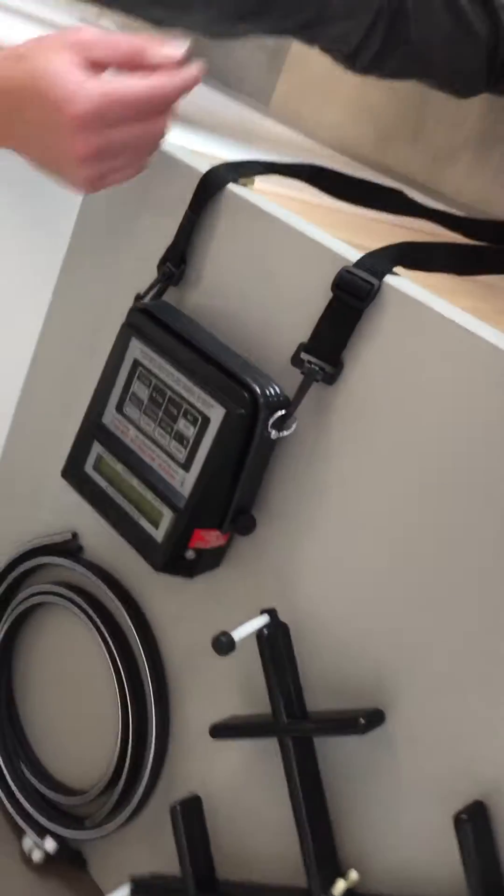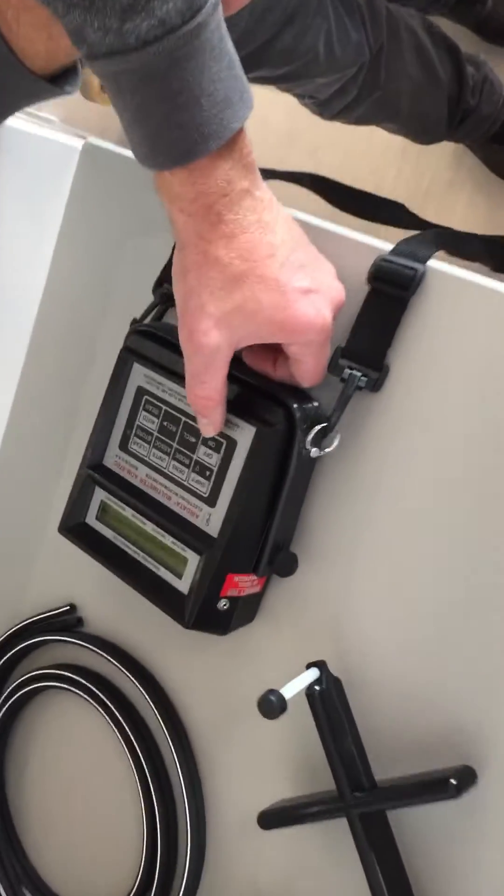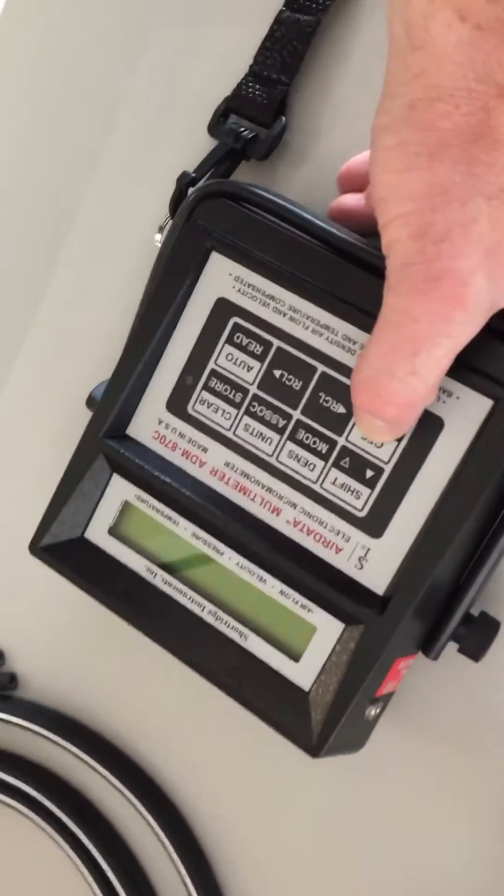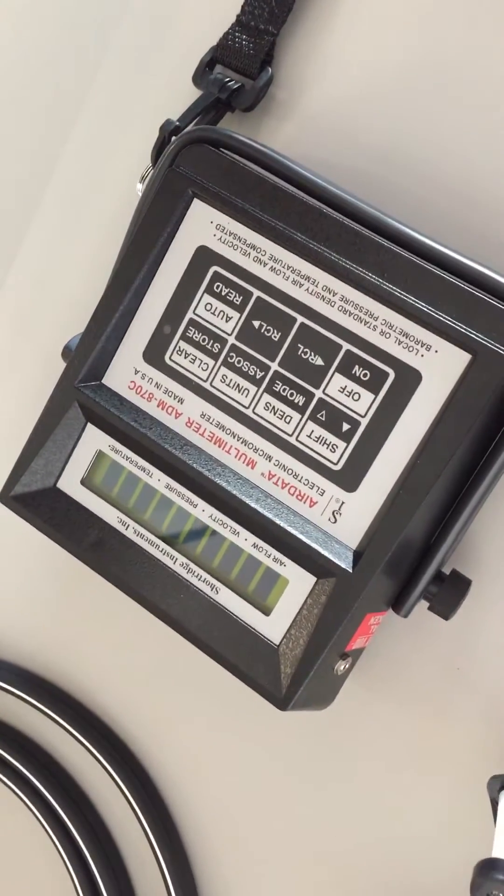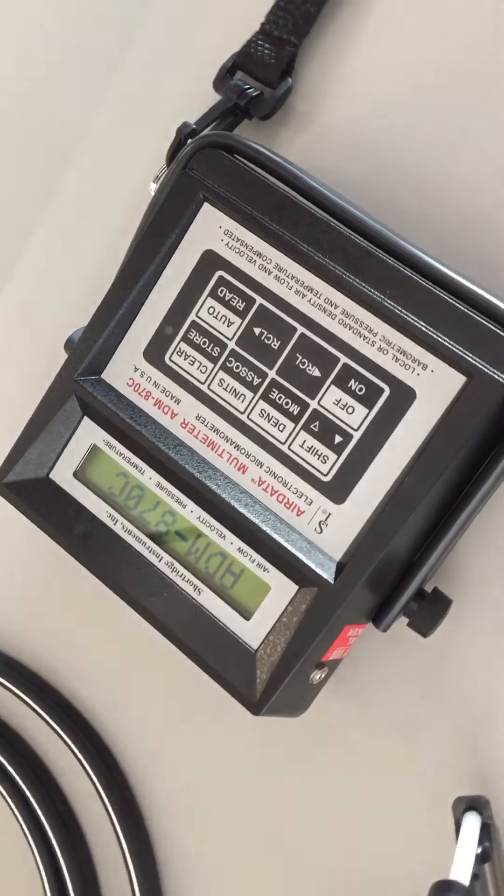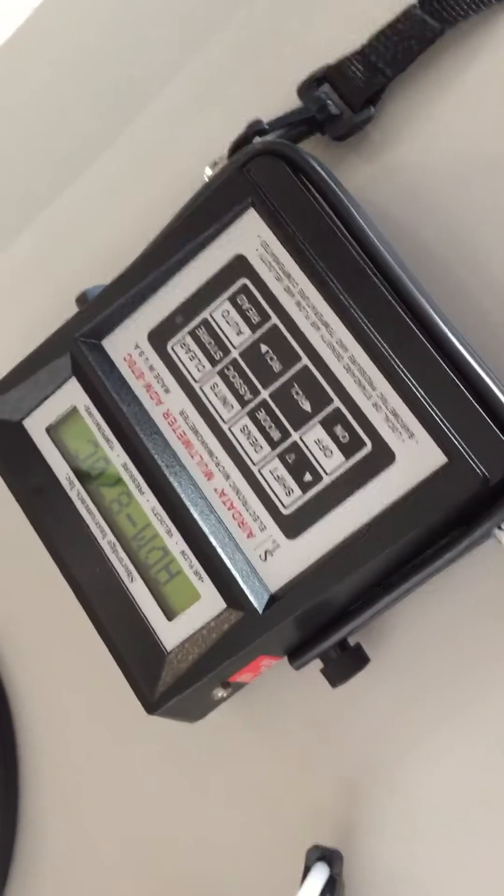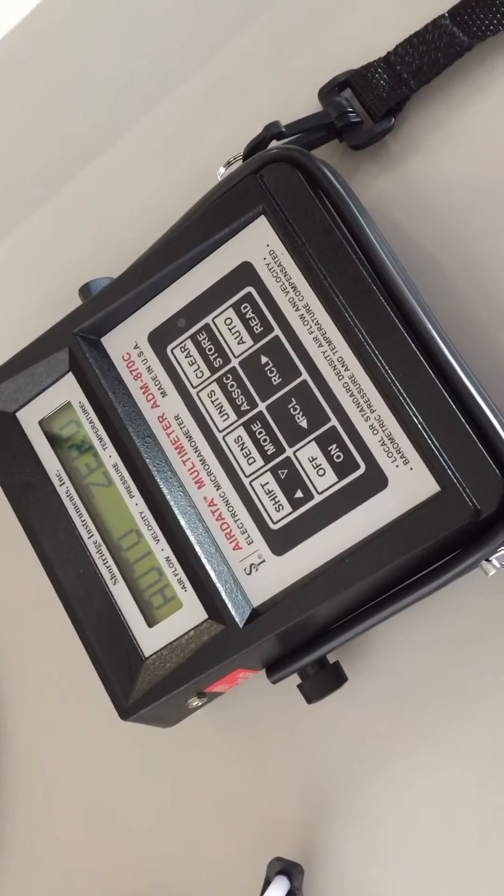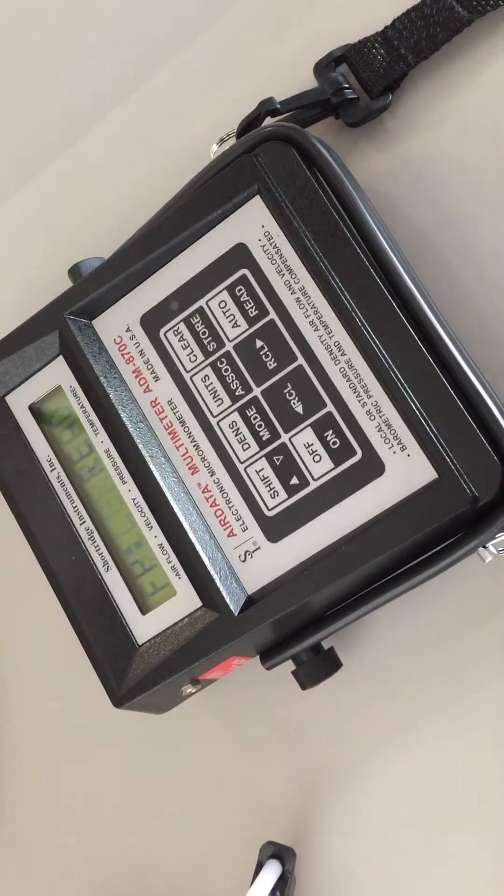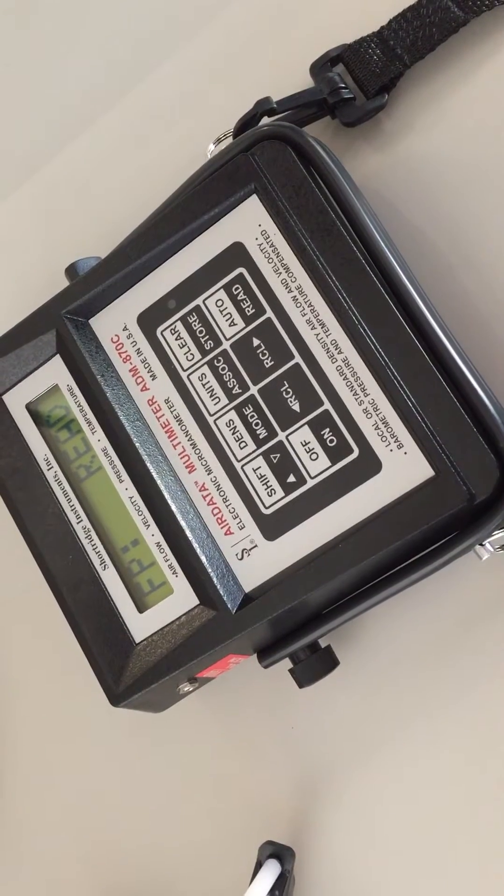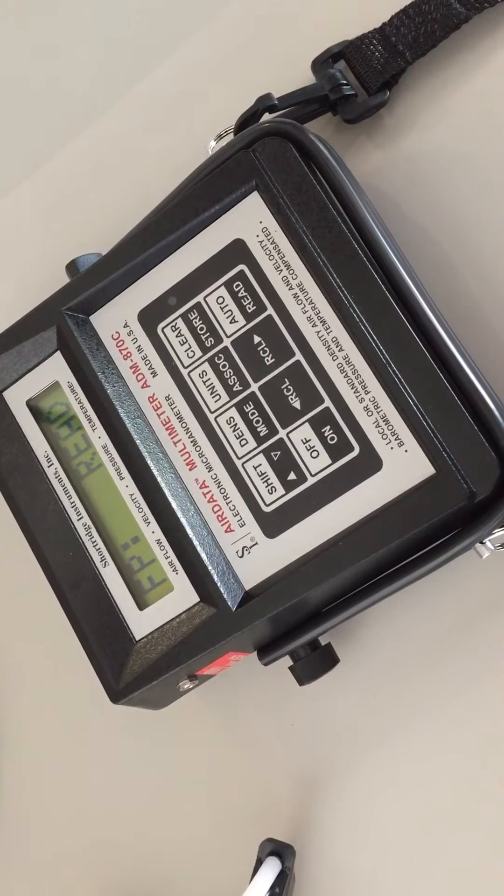In order to begin, at the terminal press the on button. As the device powers on it will tell you that it has automatically zeroed itself to your temperature and pressure.